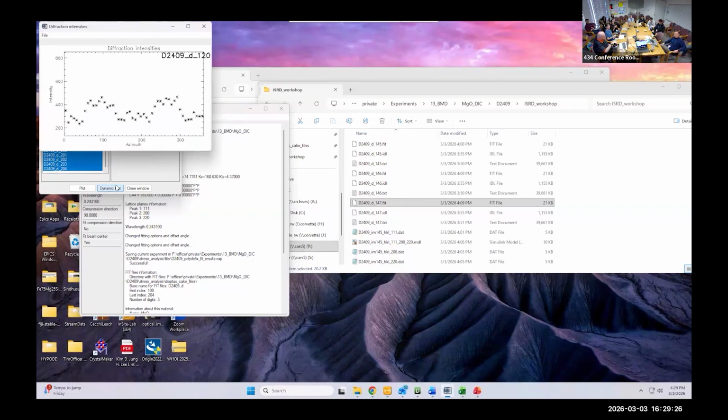Remember, we had brighter, but as Matt was saying, it's usually going to be brighter here anyway. So this probably isn't to do necessarily so much with texture yet. We haven't developed a lot of texture. This is probably just because it's brighter at the top and bottom because there's a gap. But now we are starting to actually develop texture.